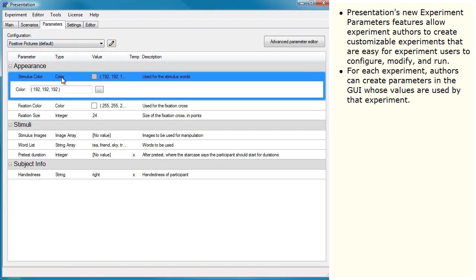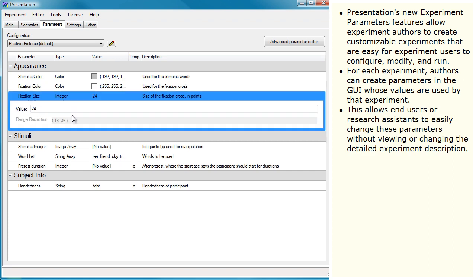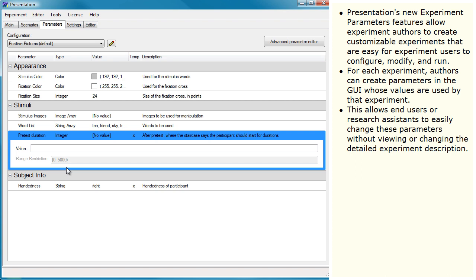For each experiment, authors can create parameters in the GUI whose values are used by that experiment. This allows end users or research assistants to easily change these parameters without viewing or changing the detailed experiment description.